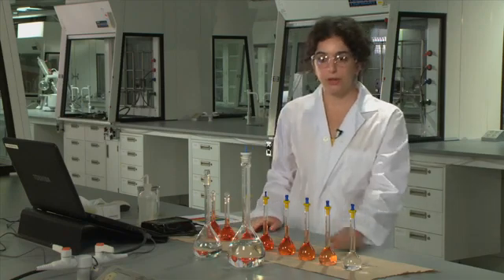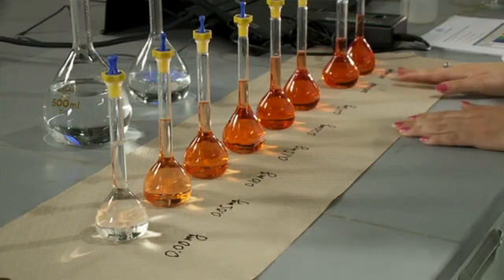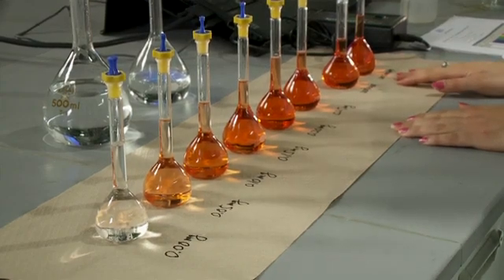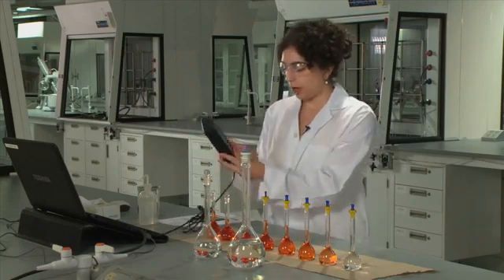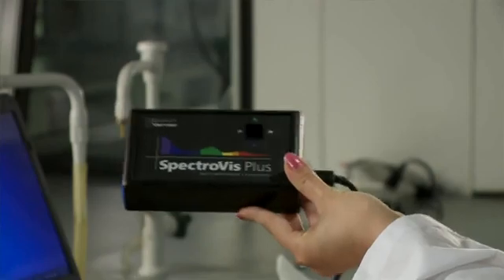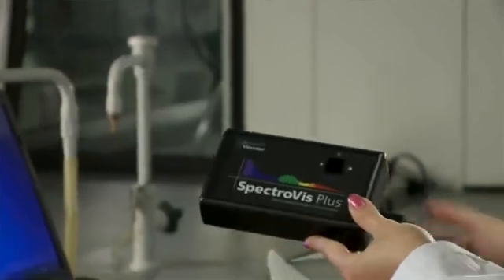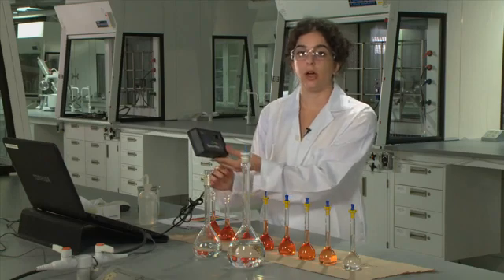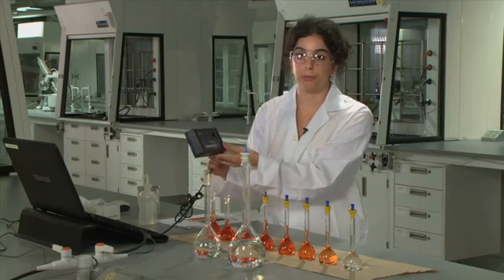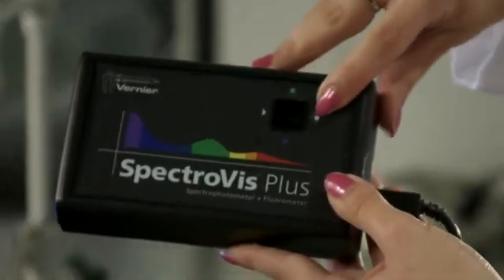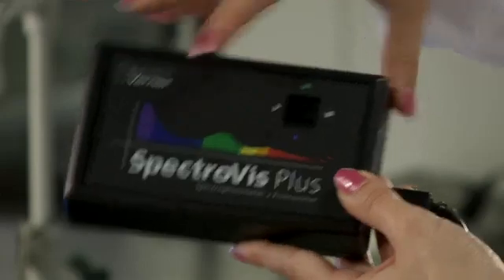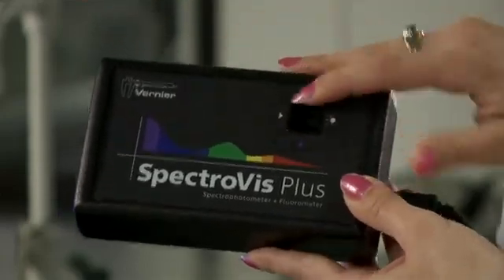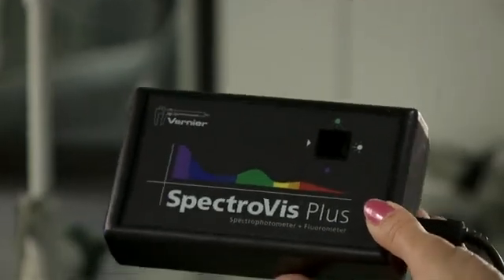Once you have prepared your standard solutions and your two unknowns, you'll then be ready to run your measurements on the spectrophotometer. The spectrophotometer that you'll be using looks like this. It's got a USB cable that connects it up to a laptop computer containing software that you're going to be using to run your measurements. The lamp of the spectrophotometer is on this side, and the detector is on this side. It has a holder that will be able to contain a cell where you'll put your sample in.